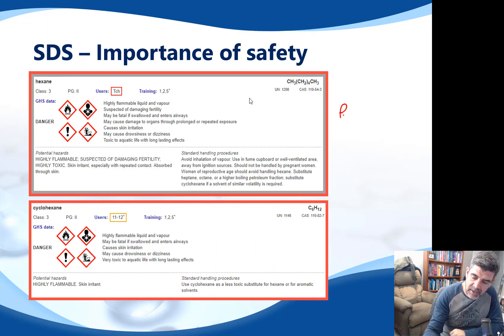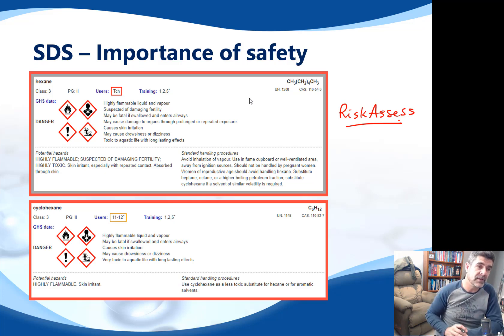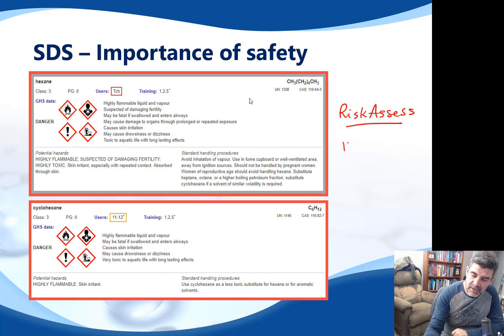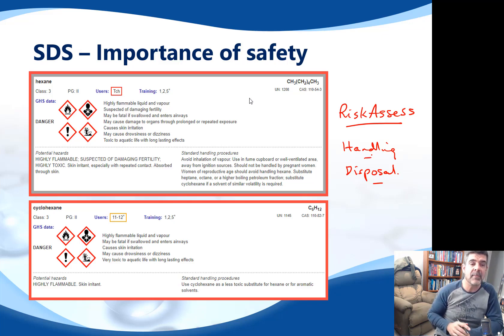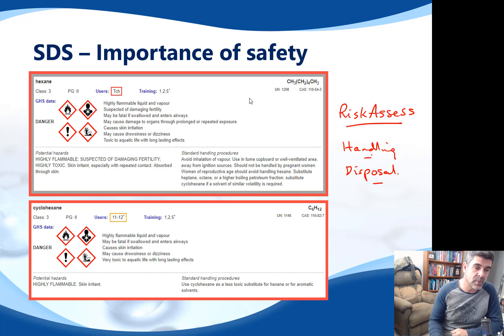RiskAssess is a great program for giving you lots of information very quickly about a range of different compounds. Safety issues are related to handling and disposal — we need to make sure that when we are assessing any chemical we are considering both of these together. It is very possible that you may be asked questions around identifying and mitigating risks when you are carrying out chemical procedures.